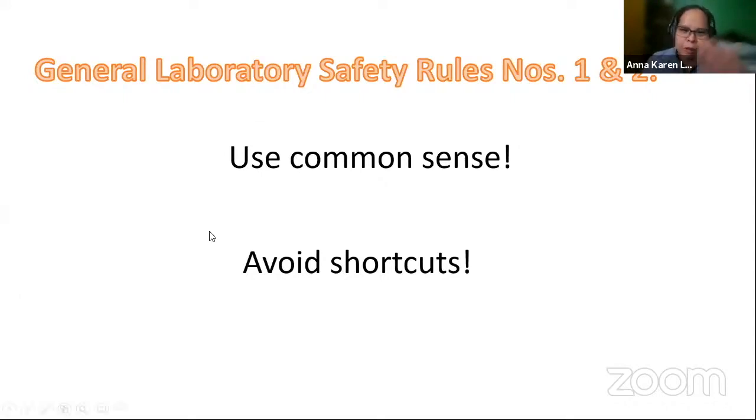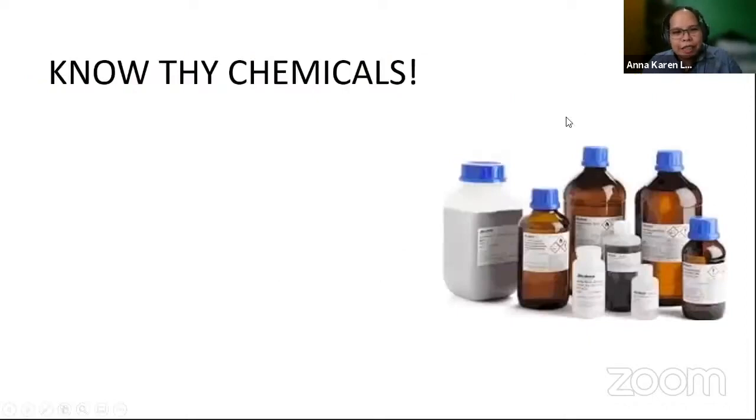Okay, and then we go to yung medyo mas specific na, especially if we're not very sure or kapag hindi natin established kung ano ba yung baseline when it comes to laboratory safety. So first is know your chemicals. So this one, it's also quite basic, especially when you're working in the chemical laboratory.